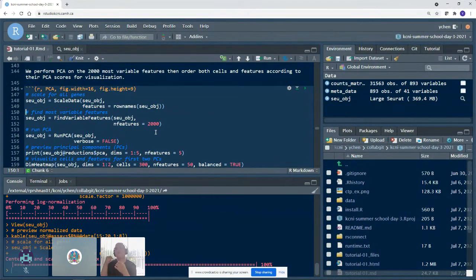Now, again, for those who are more advanced, who have a very specific question, a very nuanced case, they might make the argument of perhaps not treating every gene equally. But for the most part, very commonly, and for us for sure, we are going to scale our data so that they all have equal variance and they're centered around 0, which will help the PCA process. This is the actual code that will run the PCA. Do not run it yet, especially the binder people, do not run it yet.